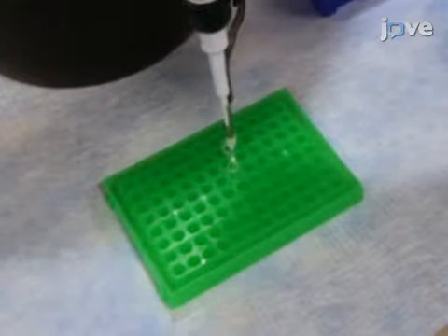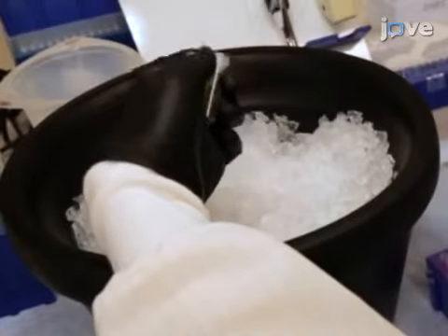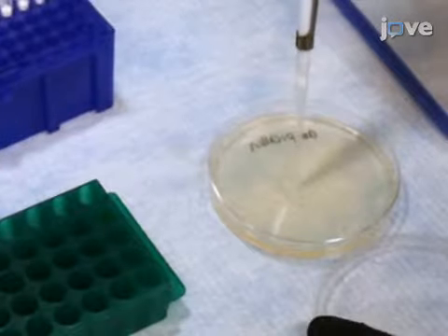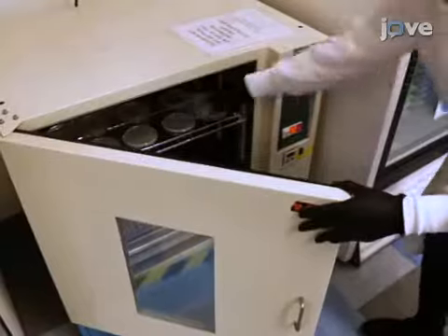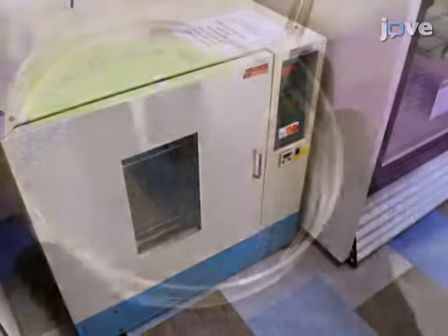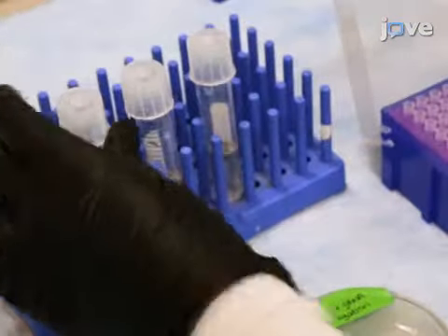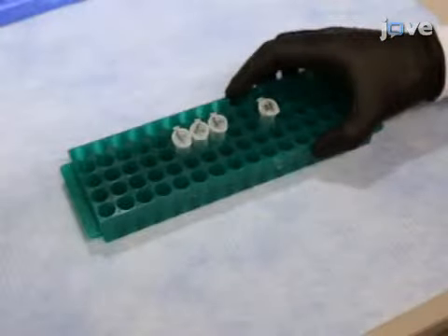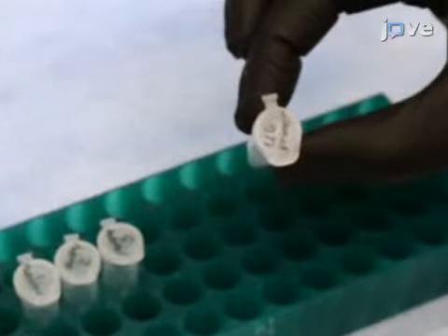Then transform Stbl3-compatible cells with 2 microliters of the ligation mixture, and then plate on a lysogeny broth agar plate containing 100 micrograms per milliliter of ampicillin. After this, incubate the plate overnight at 37 degrees Celsius. Pick 3 colonies and inoculate them. Perform mini-prep for each culture, and sequence the oligo insertion site with a U6 promoter region primer.